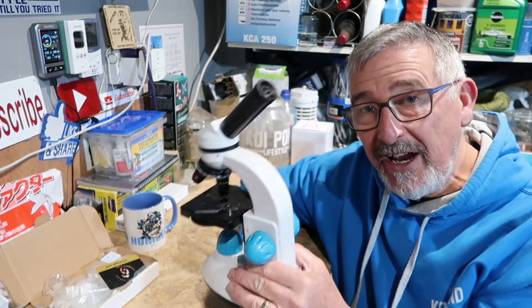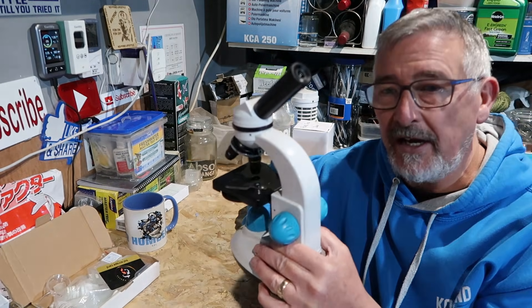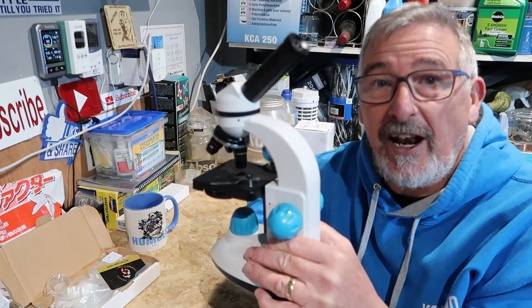Today I'm going to show you the microscope I use, the ones you can get, the cost of them, how they work, and how you can adapt them to make them work for you — little tricks and tips I've learned just through trial and error.